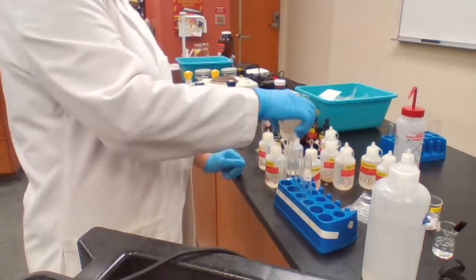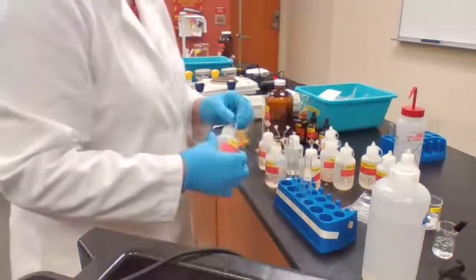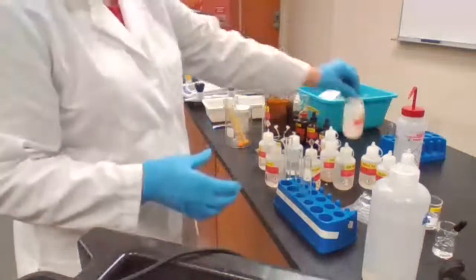After sodium hydroxide, what should I add? After sodium hydroxide, I'm going to add the iodine reagent.